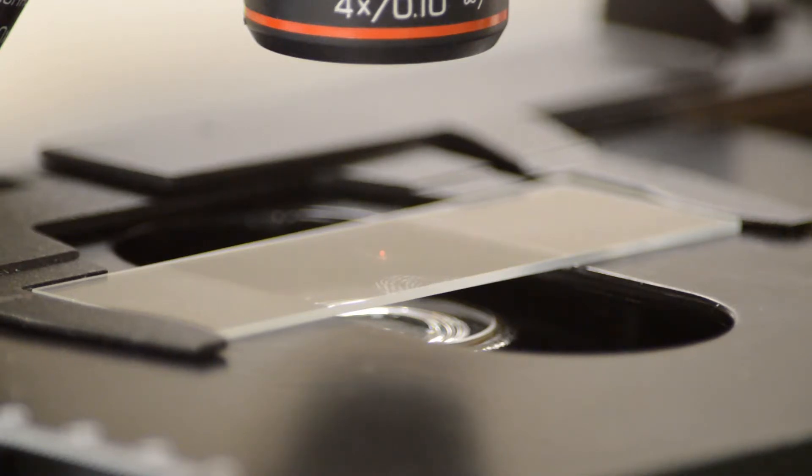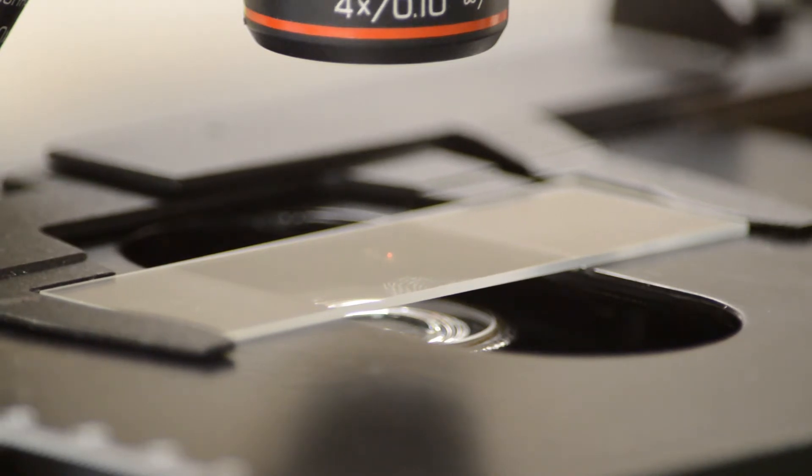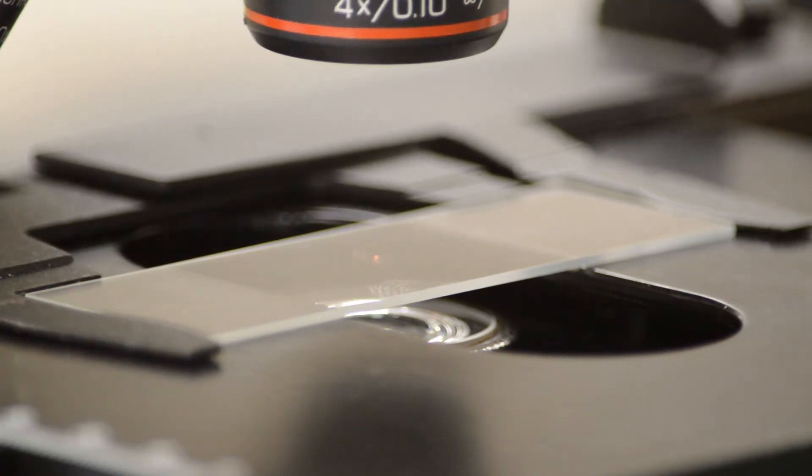We center the specimen under the 4x objective and then we focus using the coarse focusing knob to push the material as far up as possible, and then the fine focusing knob to bring it into focus. And you can see how in this particular case we now have this in focus.